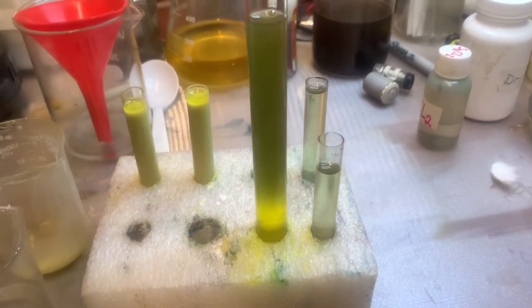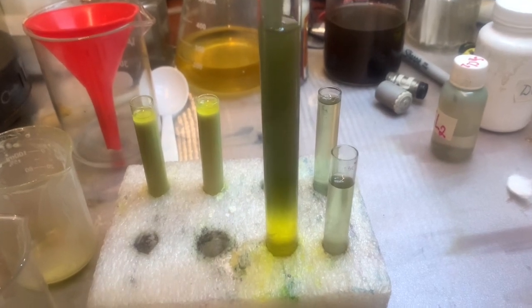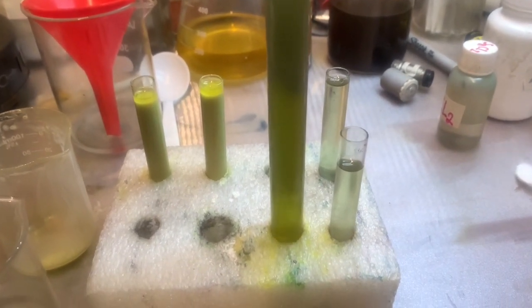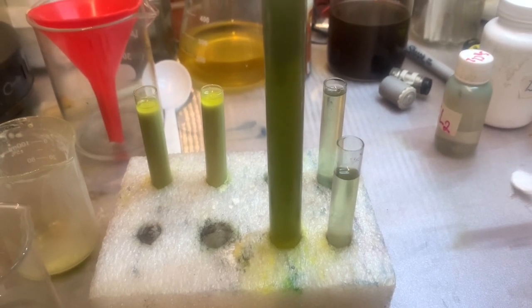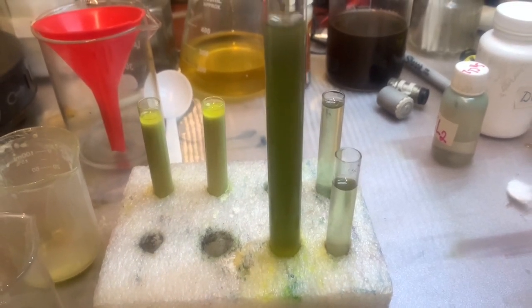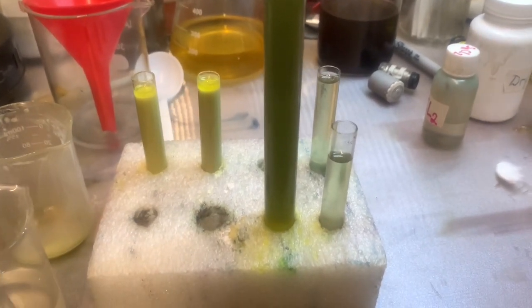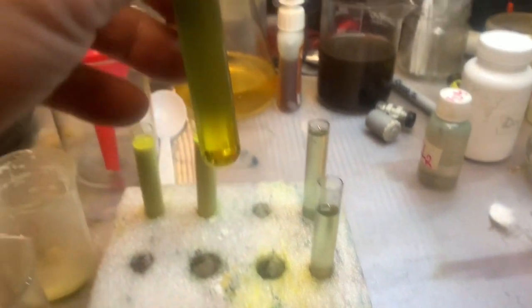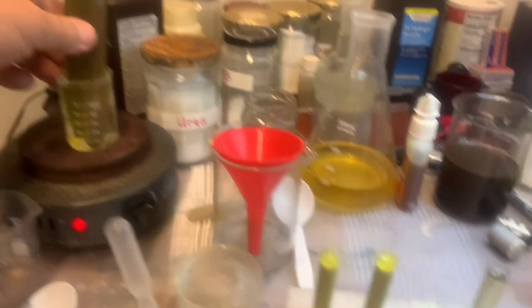That way we're putting in SMB. My SMB has water. And mixing with the pipette, I'm pushing everything down. And then we put okay, fine. Let them get hot, both together.